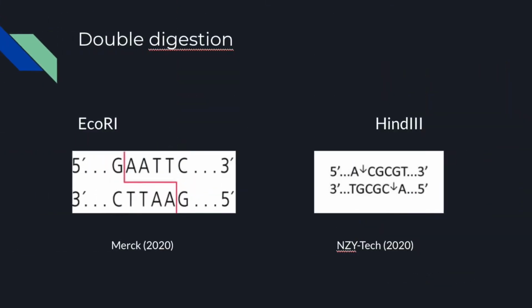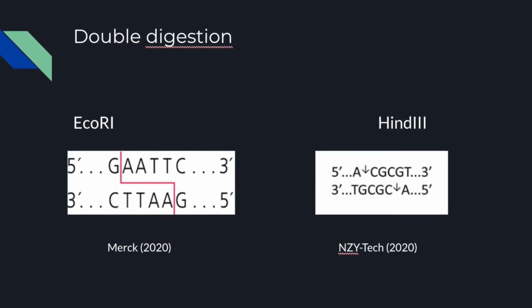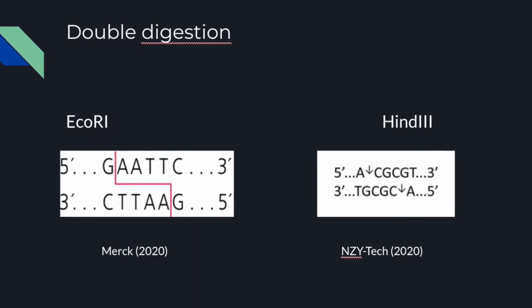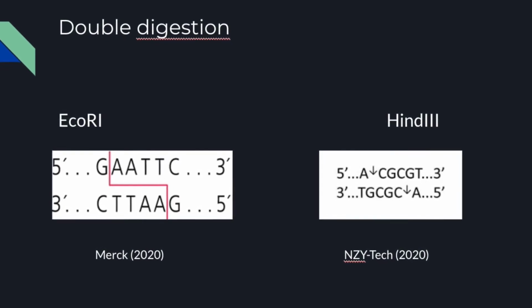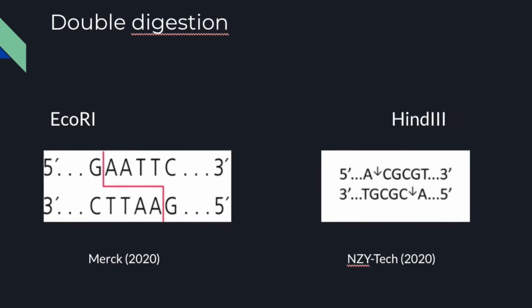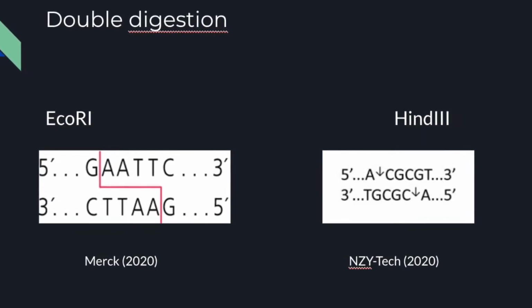To accomplish this process, it is necessary to find proper enzymes that will do the double digestion. This method takes advantage to clip the DNA at a specific sequence. Our working temperature is 37 degrees with a cofactor, Mg2+, and our restriction enzymes are EcoRI and HindIII. These restriction sequences are not present in our gene of interest.